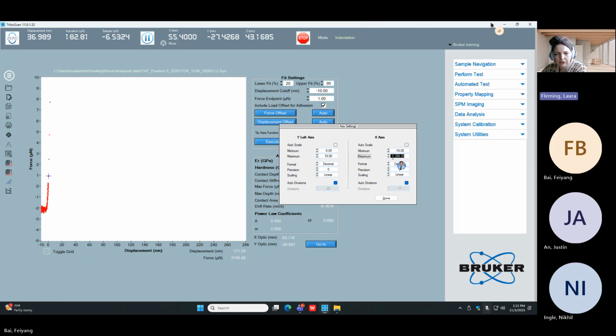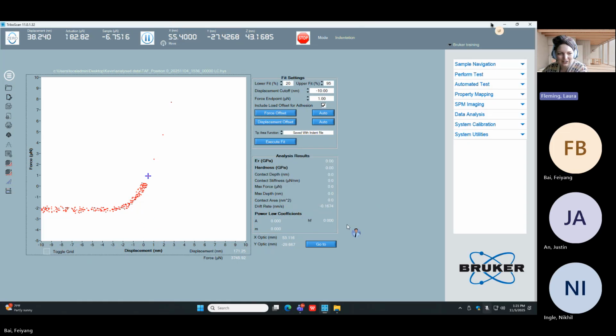So maybe it's a little clearer in this one. Where would you say the 0 point? Yeah, go ahead and click done here. Sorry, I'm rushing you. Thank you. Where would you say the 0 point of this should be? Here. Yeah, maybe even a little further back because it is still increasing here. So like right here. Okay, as long as we're all in agreement for why that should be the 0 point.